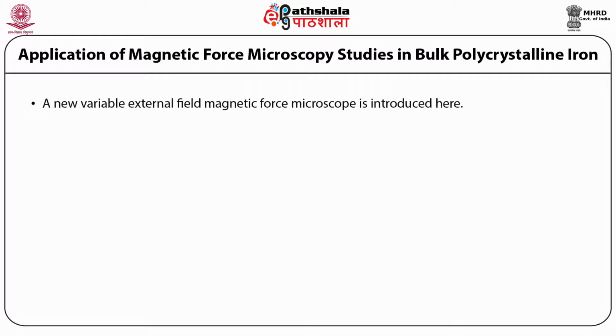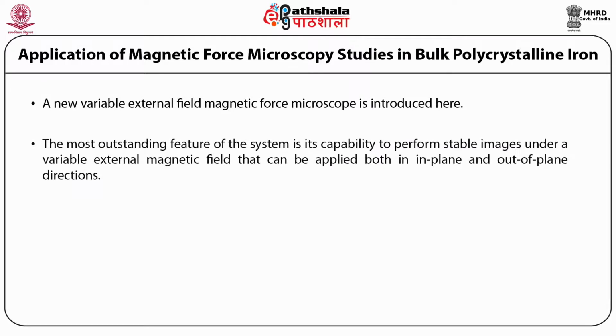A new variable external field magnetic force microscope is introduced here. The most outstanding feature of the system is its capability to perform stable images under a variable external magnetic field that can be applied both in plane and out of plane direction.